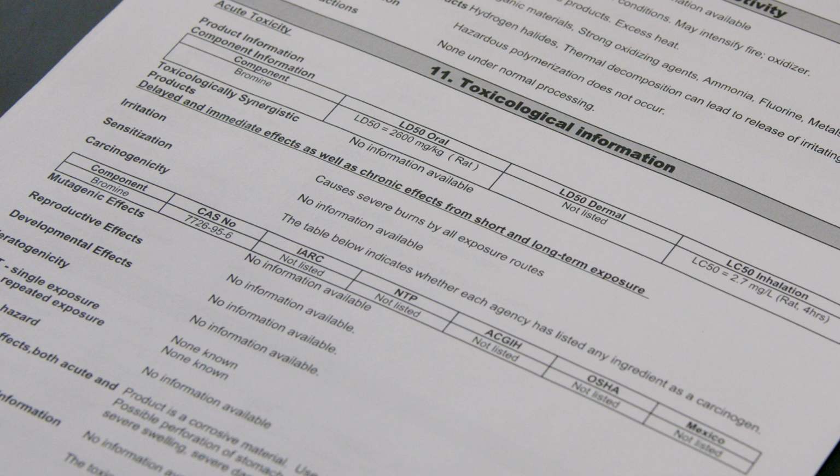Toxicological information in Section 11 provides details on the chemical's potential health effects, such as acute and chronic toxicity. This section is crucial for understanding the risks you're taking in the lab.